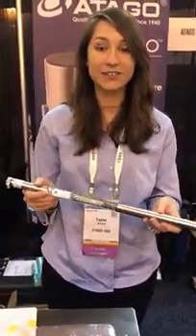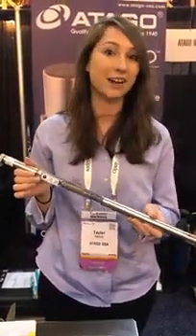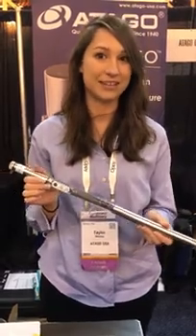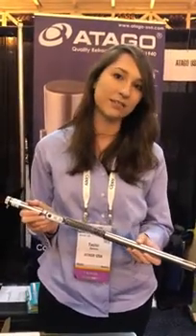Well, the first thing I want to show you is our frying oil checker. This is a digital instrument that can help you determine the quality of your oil to know when it should be changed. Do you have any method right now to check the oil? Yes, we do have something like — test strips — just check the color. How often do you have to do that? Once a day.